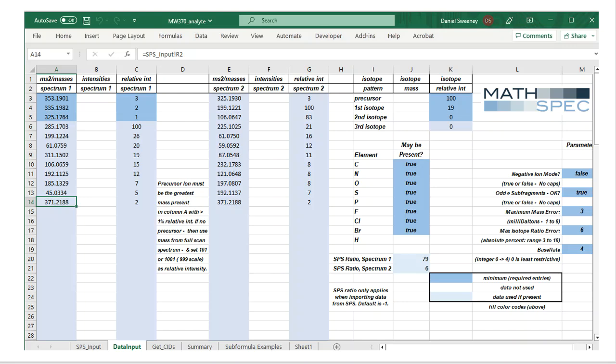Let us look at the workbook that was created with the transform YouTube video. We've already filled in the proper columns and parameters. This data input worksheet was also saved as a CSV file. Now there's two differences between the parameters for partitioning with MEP and partitioning in transform.